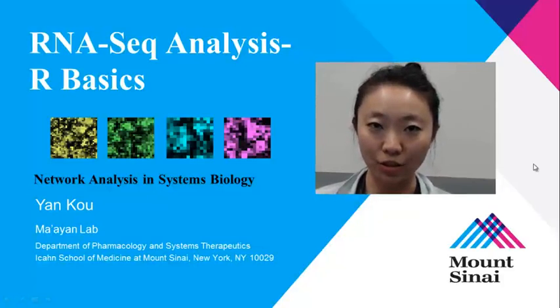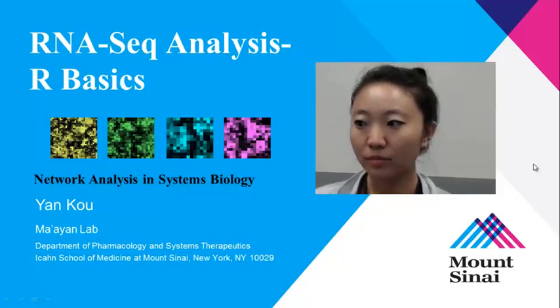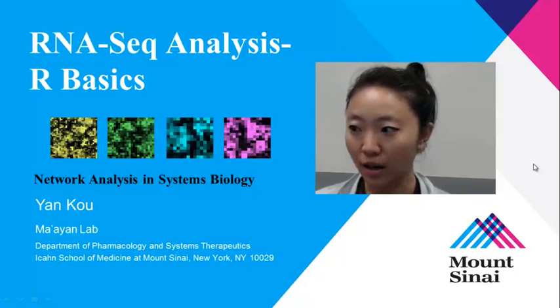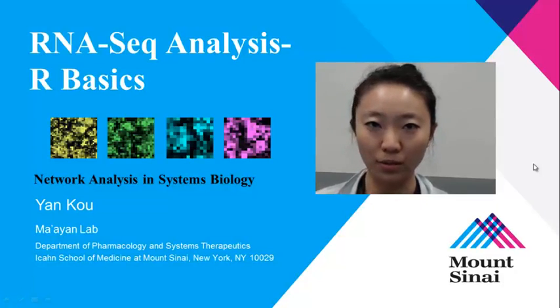In the previous lecture, I introduced the pipeline of TopHat and Cufflinks to analyze RNA-seq data. Once we construct the transcriptome, we will be able to apply various statistical methods towards a deeper understanding of your data. In this lecture, I will introduce the CummeRbund R package that comes with the pipeline for the downstream analysis.